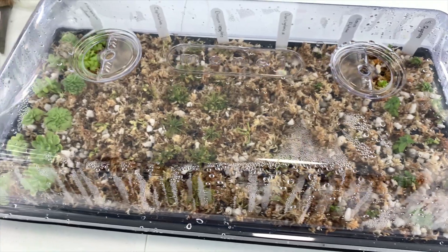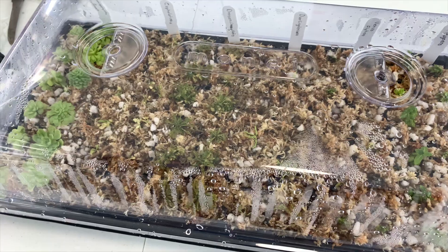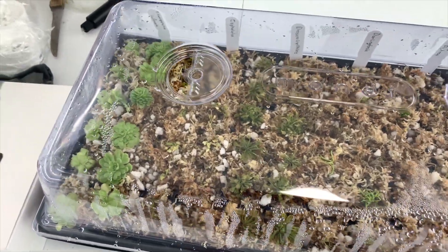I think in the next week or so I want to fully remove the dome. After that, I will start to acclimate them to the outside in the shade, and then later on to the sun.